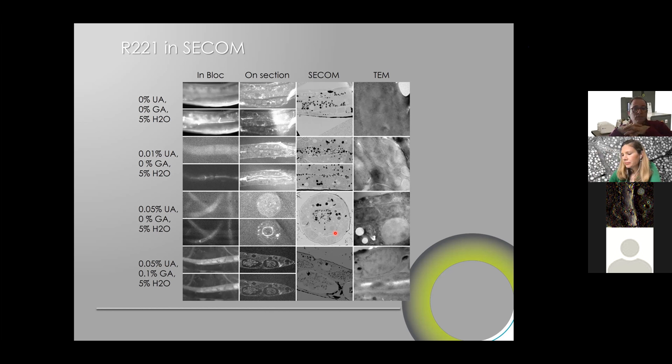It is designed for volume electron microscopy, where the block actually remains solid and you shave it on the surface. What we also noticed, and it happened to us once, is that it just chopped off an entire piece inside the block. That's what happened once with the nucleus, where the entire nucleus was chopped off from the block. So the embedding properties of the resin are not as great as HM20, for example, or as EPON. But it gives us some good results for the applications we're looking into.